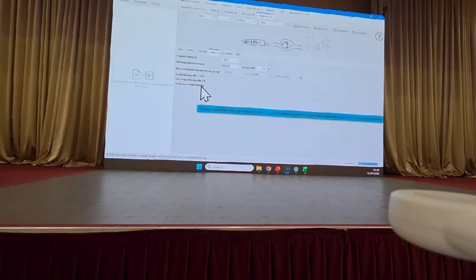And the last thing, apply strict shape filtering. So ideally, our peaks should be relatively Gaussian shaped. We could put a filter that says, hey, is this peak a nice shape? Yes, keep it. No, get rid of it. Today, we already know all our peaks are going to look amazing, of course, so we will not check it. Excellent.